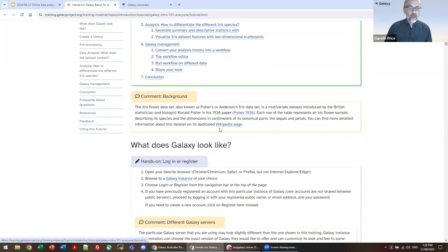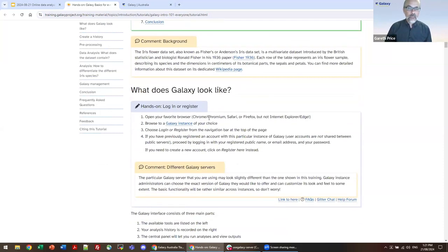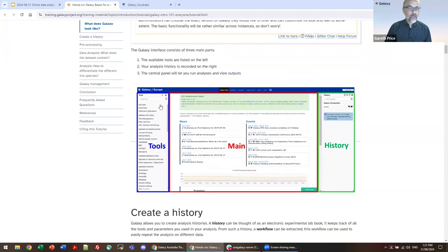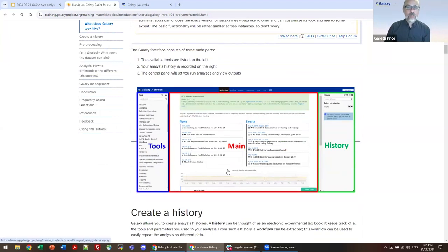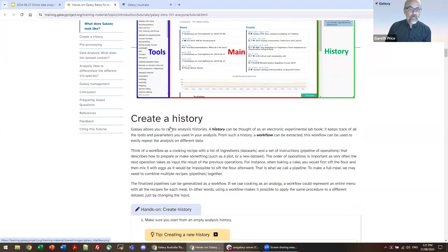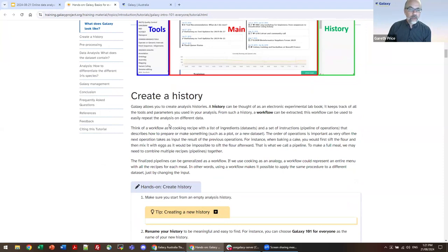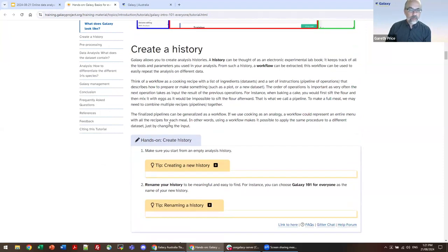So what does Galaxy look like? It has the tools on the left side, that main window for exploratory interaction, and your history on the right-hand side. We are going to create a history and go through these steps one at a time.